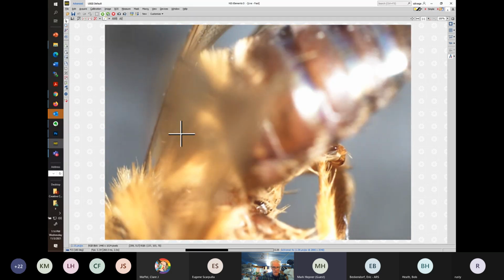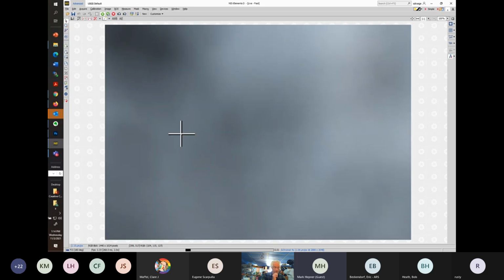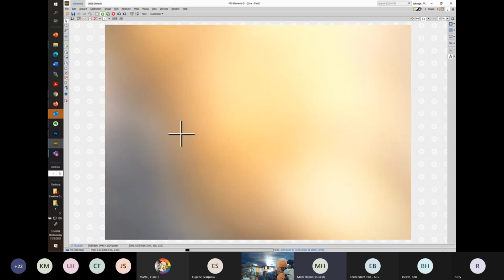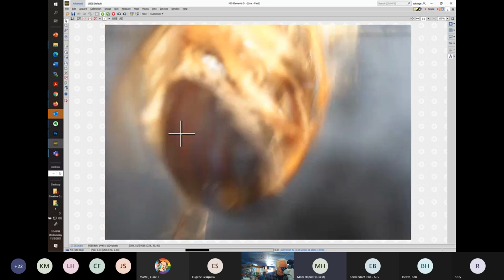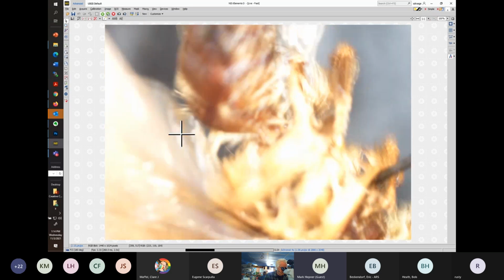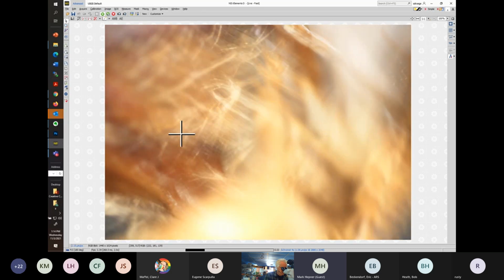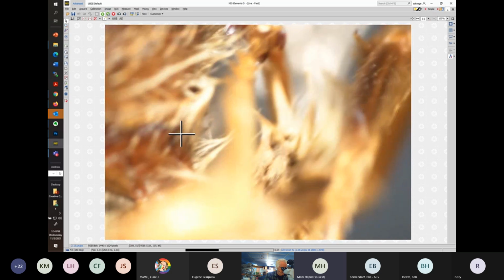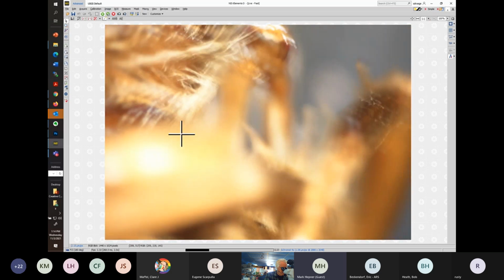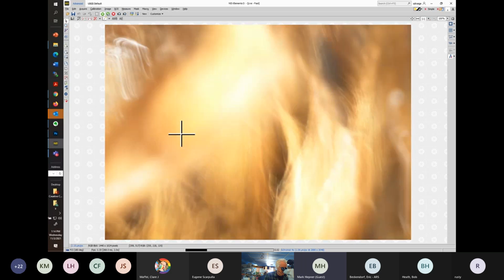You can see how much slower this might be. I'm going to take it off and just confirm it, but the specimen's legs are all curled around, and I see what I think is arolium. I also see that, or do I? I see the claws are cleft.